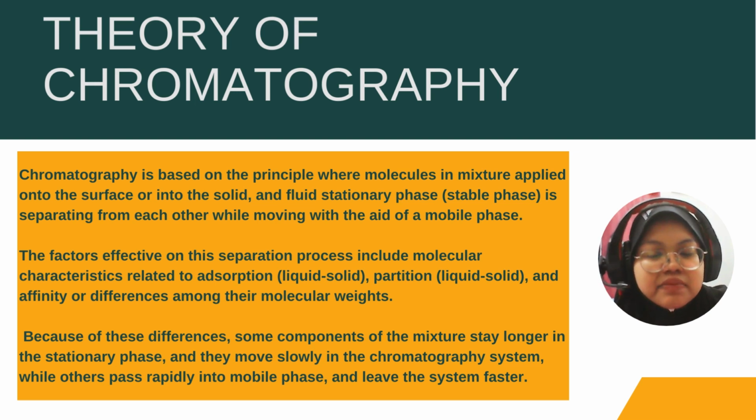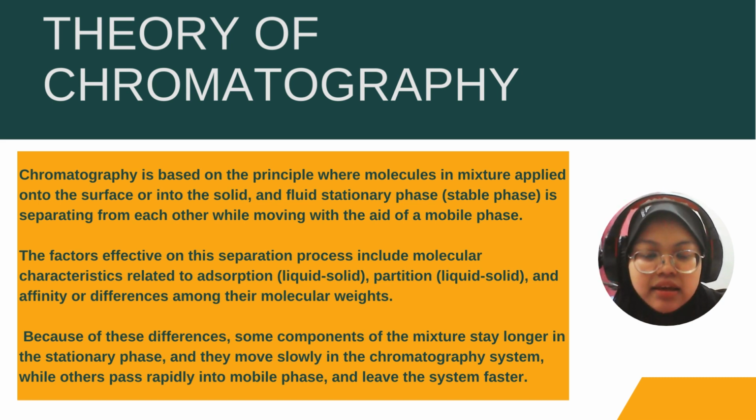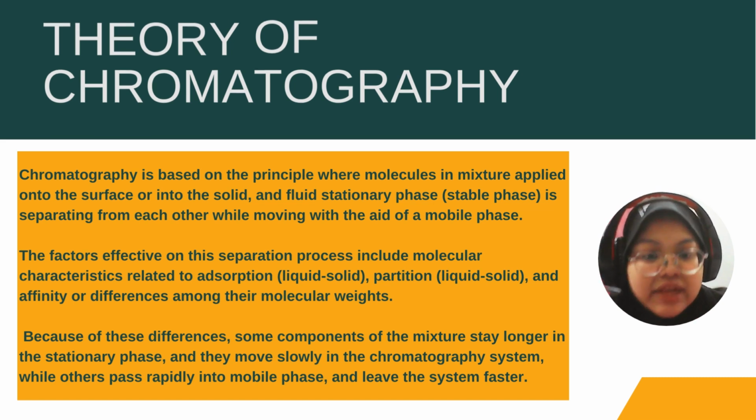Factors affecting the separation process include molecular characteristics and affinity, or differences among their molecular weight. Because of this difference, some components of mixtures stay longer in the stationary phase and move slowly in the chromatography system, while others pass rapidly into the mobile phase and leave the system faster.